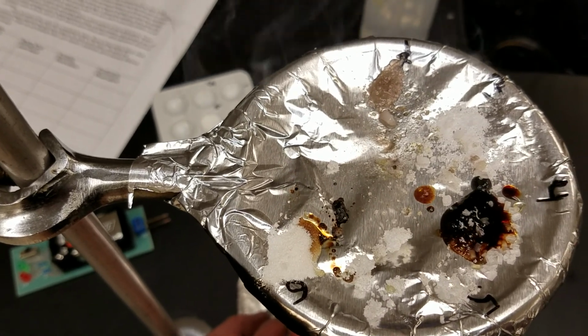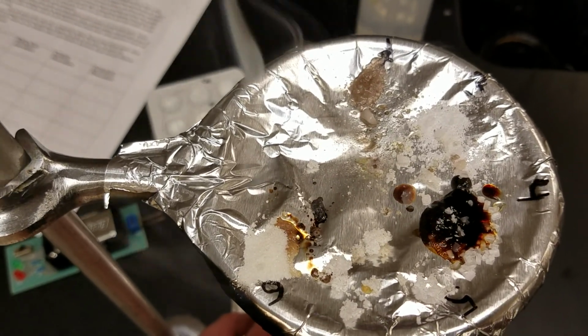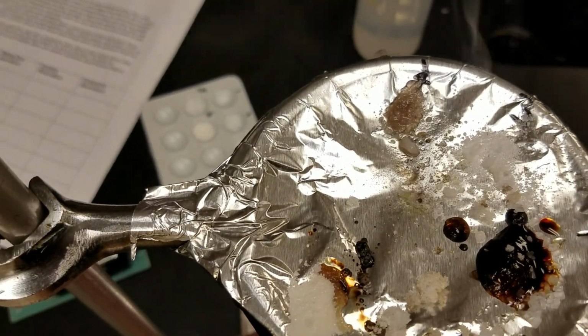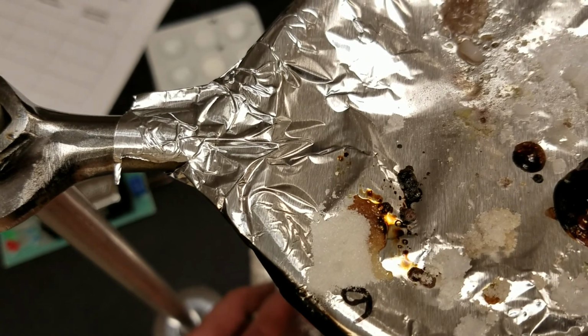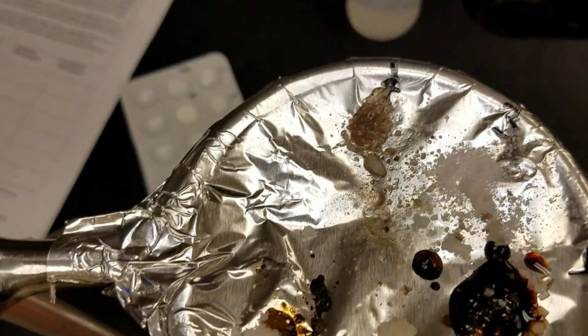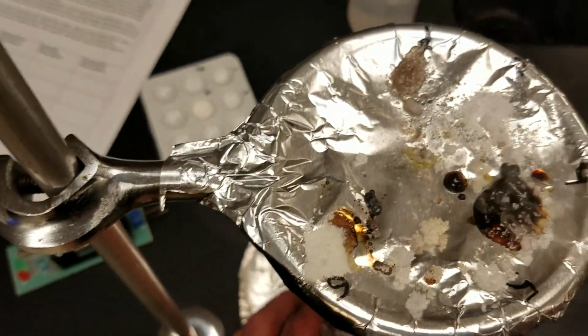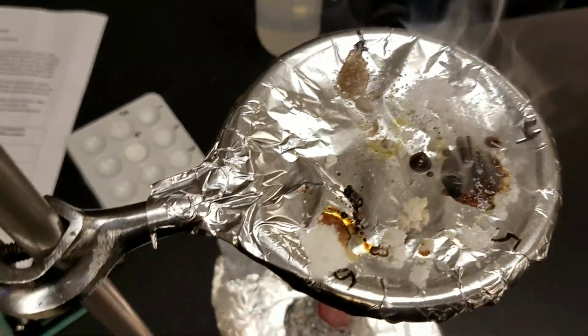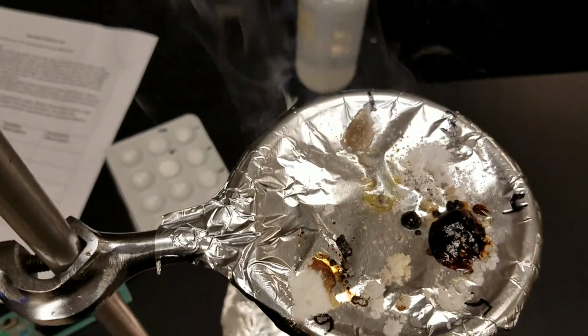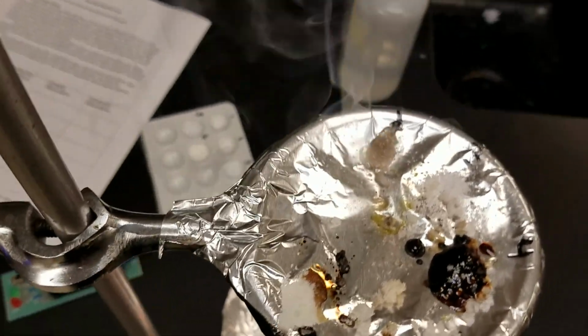That sugar's still boiling. It's getting hot again. So I think we can say that our ascorbic acid did melt and did change colors. There's a lot of it on there, so that's probably the main factor as to why it didn't go faster.